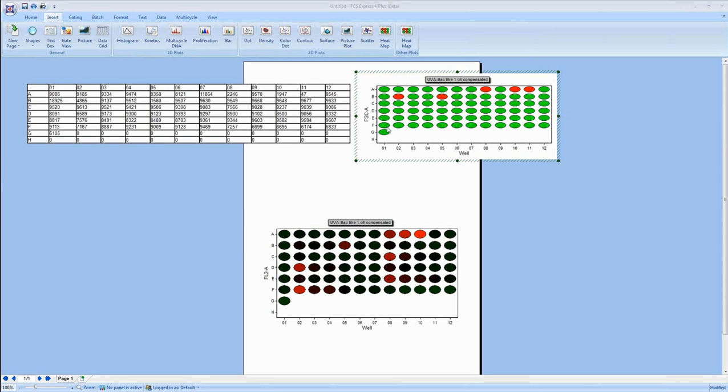And when I'm talking to a flow and possibly image cytometry crowd, I always explain gating a little bit. For those of us who are in flow cytometry, it's very obvious what it is. But in image cytometry, we use something called thresholding more often. And essentially a gate in FCS Express or in flow cytometry is equivalent to a threshold in image cytometry. But gates can be in more than one dimension. Essentially, if we want to look at two different fluorescent channels at the same time, we can do that. And what I'm going to do now is show you a little bit about gating these heat maps, and I'd also like to show you about other gates in FCS Express and how they can be used.